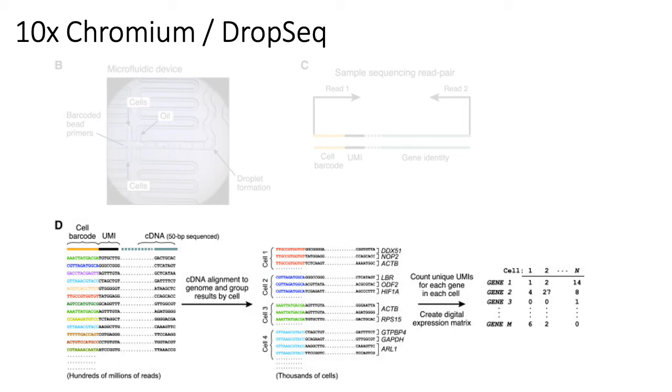And so how we get around the PCR amplification bias is that when PCR is applied to increase the total number of copies of each cDNA, every original cDNA molecule has a unique molecular identifier that corresponds to exactly one transcript, in theory, that was hybridized to one of the beads.